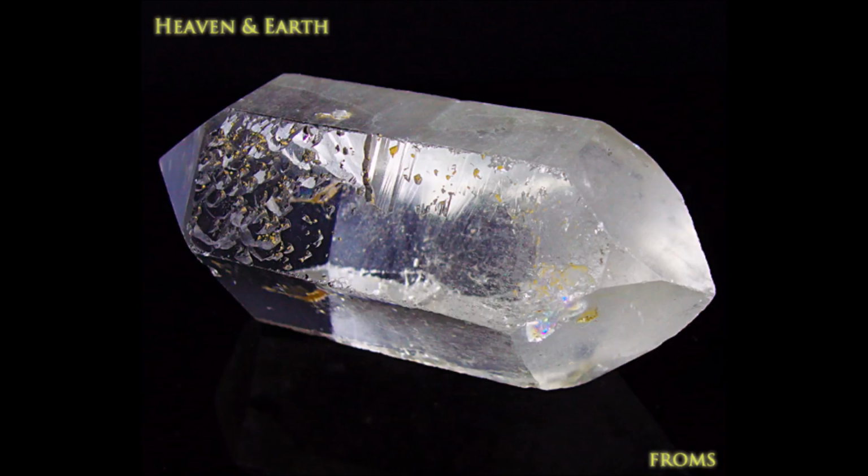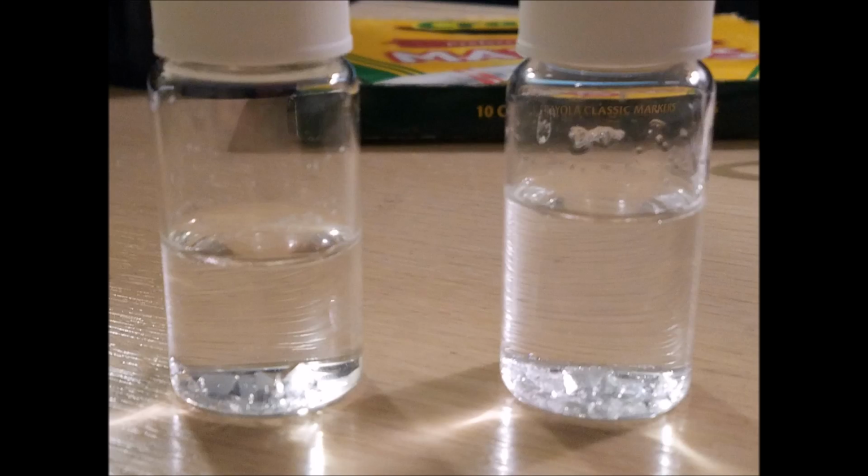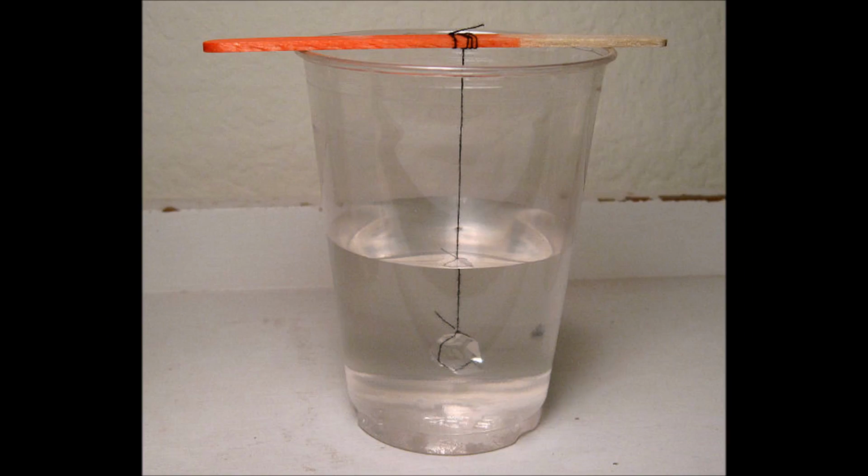If one would like to create one high-quality crystal, they would create a solution which is saturated with alum, in the same way that we created a solution for this project. However, just leaving a saturated solution to slowly evaporate creates many crystals, as seen in my personal vial. This can be changed by suspending a seed crystal within the solution.